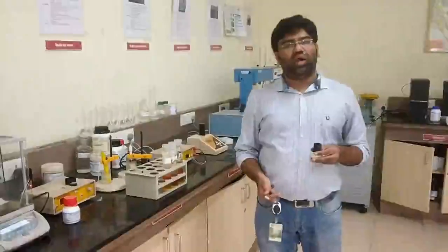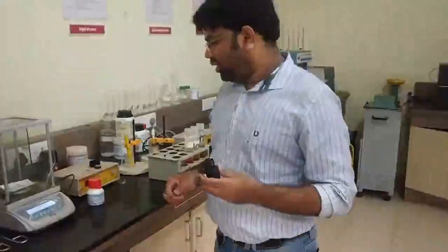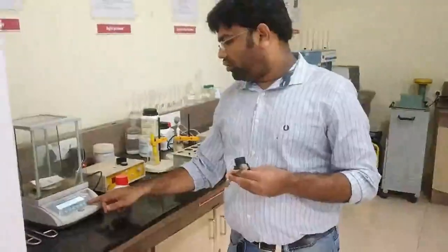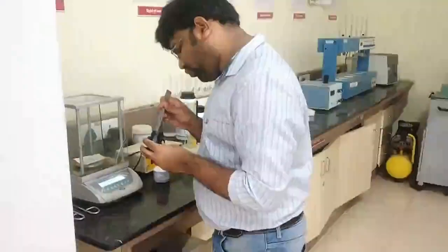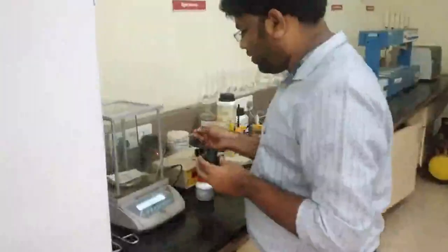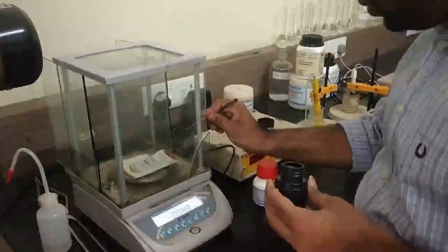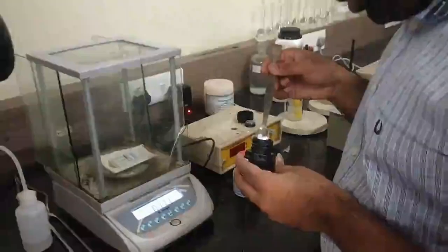The next procedure is to add 200 milligram of silver sulfate. So 200 milligram, we are going to measure it properly. I'll be showing how we are going to add it. It is just in powder form. 200 milligram means 0.2 gram. A very small quantity.